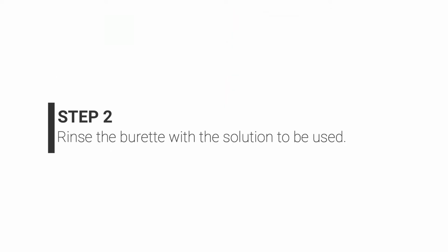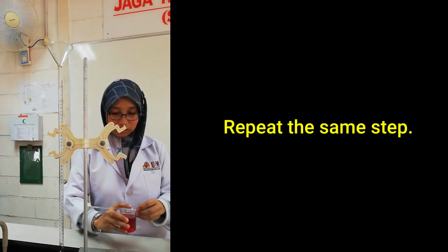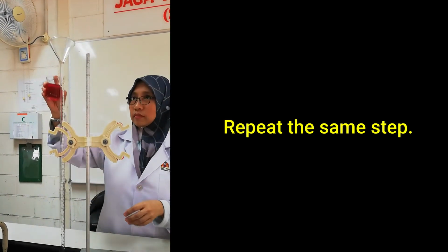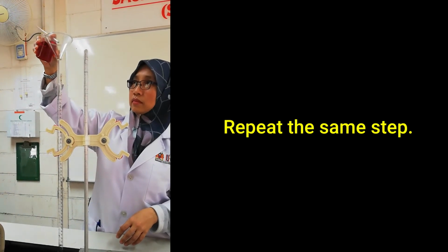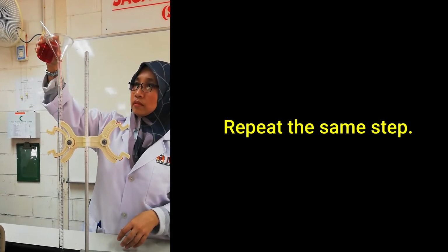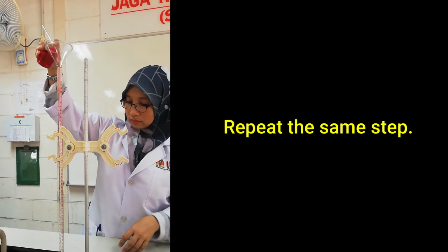Next, rinse the burette with the solution to be used. Rinse the burette the same way as rinsing it with distilled water. Fill only a third of the burette with the solution.